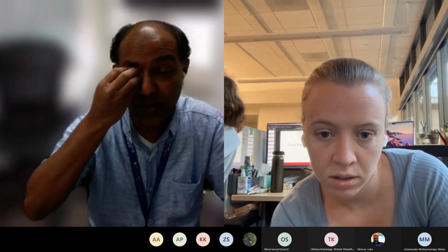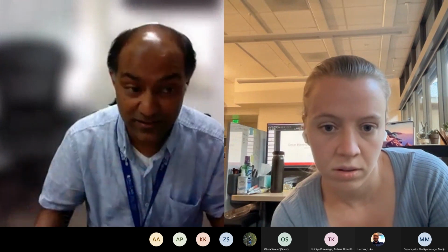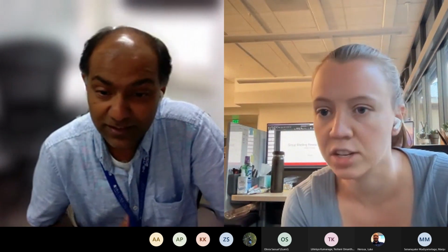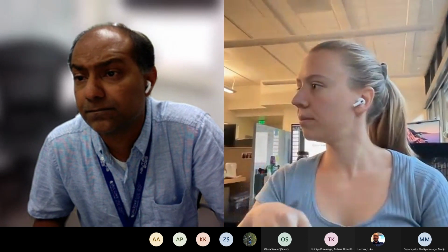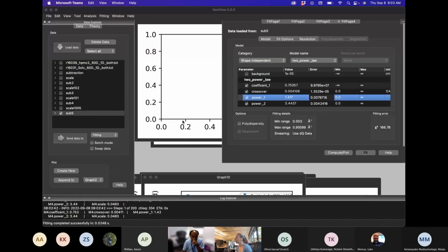The first window, the leftmost top window, that's for the entire desktop, so any application can be seen. I think Olivia's going to try to share on hers. Mine isn't showing up for some reason. Okay. Yeah, this is your SASView.